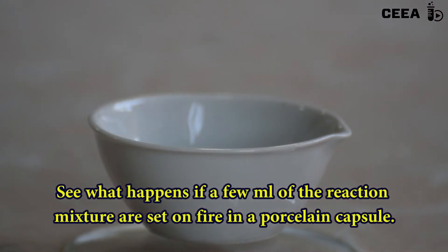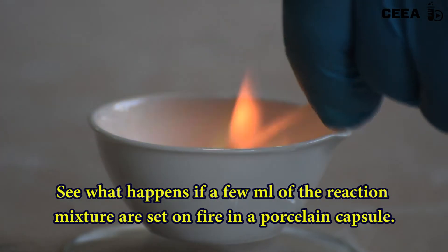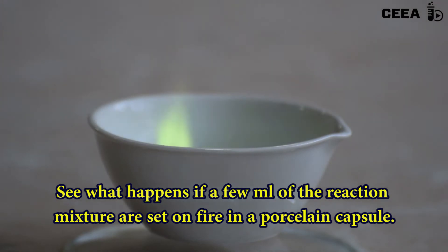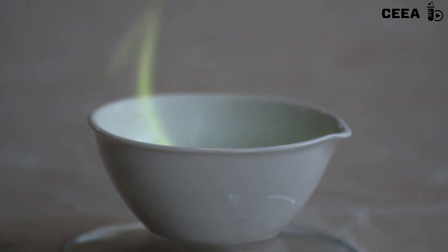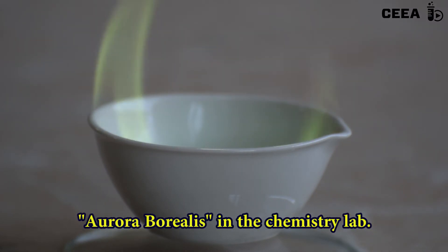If we pour the reaction product in a porcelain capsule or a watch glass and ignite it, we get a large green flame similar to the northern lights. The green color of the flame is due to the presence of boric compounds.